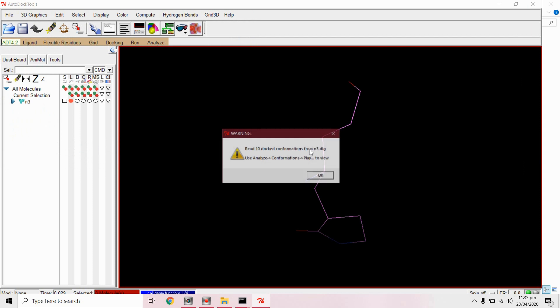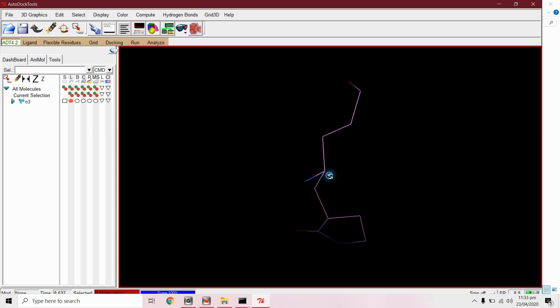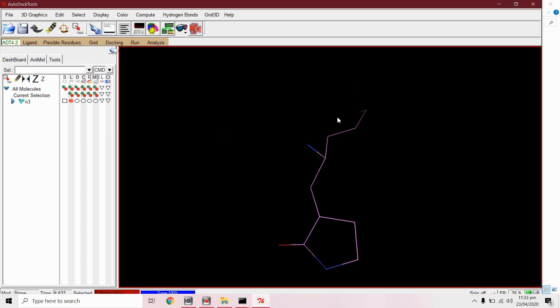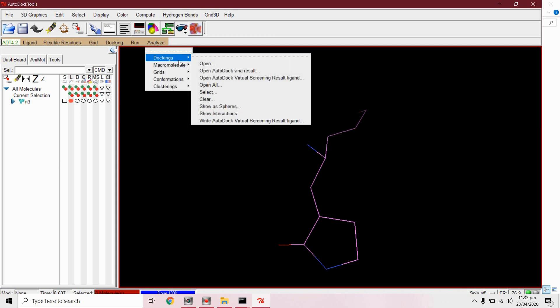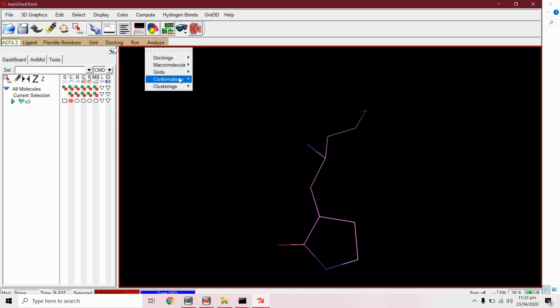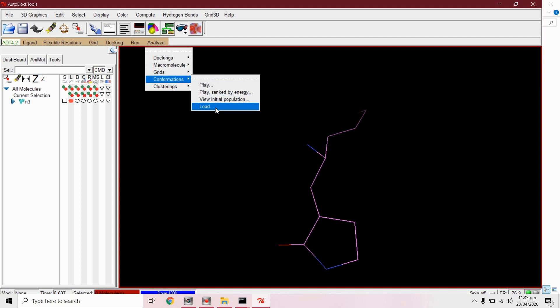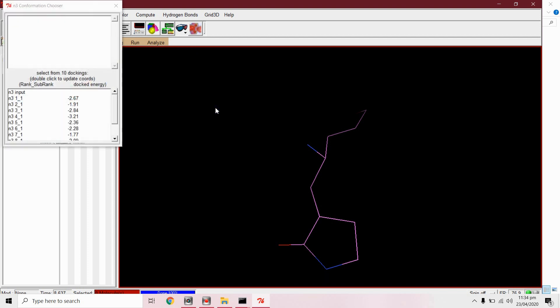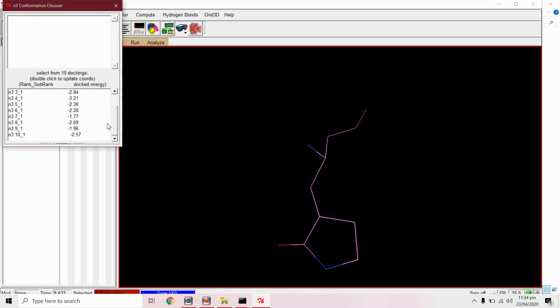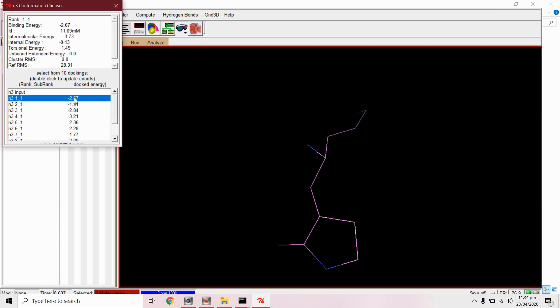We can analyze this by using AutoDock tools. So open your AutoDock tool and go to analyze from docking, open this file. It has created 10 confirmations. You can load confirmations so you can take a look on their binding energies and other parameters, intermolecular energy or binding energy, all these parameters.